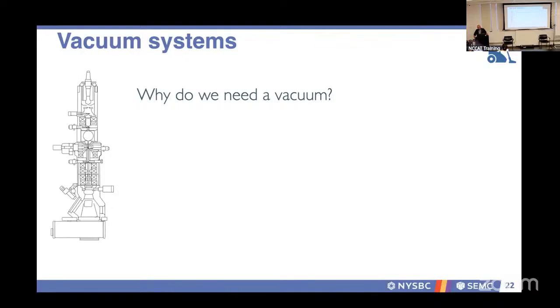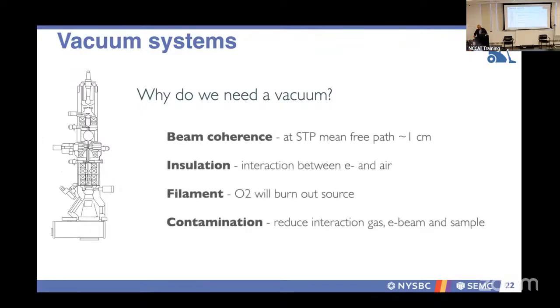We mentioned that when we were doing sample prep yesterday, we also wanted not only a thin sample, but a sample that can withstand a vacuum. And why is that? Well, if you send an electron through air, it's not going to get too far. You're going to have a lot of energy release within about a centimeter. And not only that, we want to keep our sample very cold. So we're not literally submerging our sample in liquid nitrogen once it's in the microscope, it's in a vacuum, but through thermal contact, we can keep it quite cold.